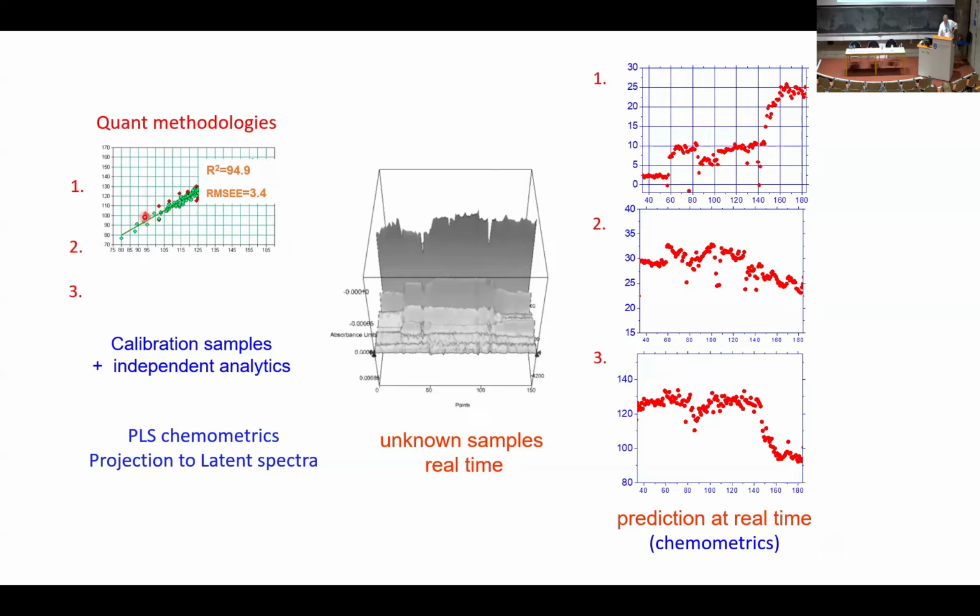Sorry for this big thing. Then I could collect a spectral sequence. Here's a spectral sequence. That's a recording for about 3 hours or 2.5 hours. It's recorded every 3 minutes. It's a continuous production on the production line. Actually, this is not the production line, it's the incoming material. And you can see how different properties vary.